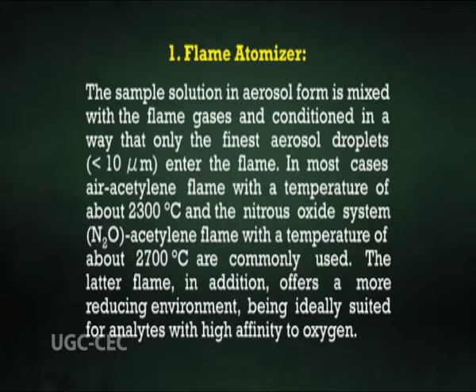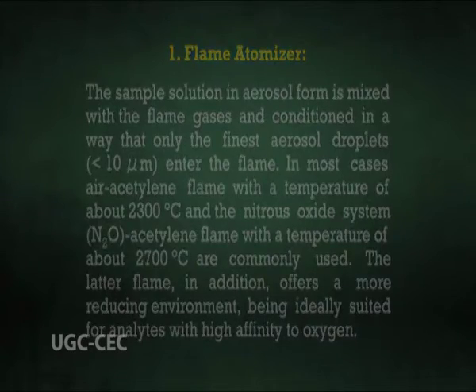In most cases, air-acetylene flame with a temperature of about 2300 degrees Celsius and a nitrous oxide (N2O) acetylene flame with a temperature of about 2700 degrees Celsius are commonly used. The latter flame, in addition, offers a more reducing environment, being ideally suited for analytes with high affinity to oxygen.